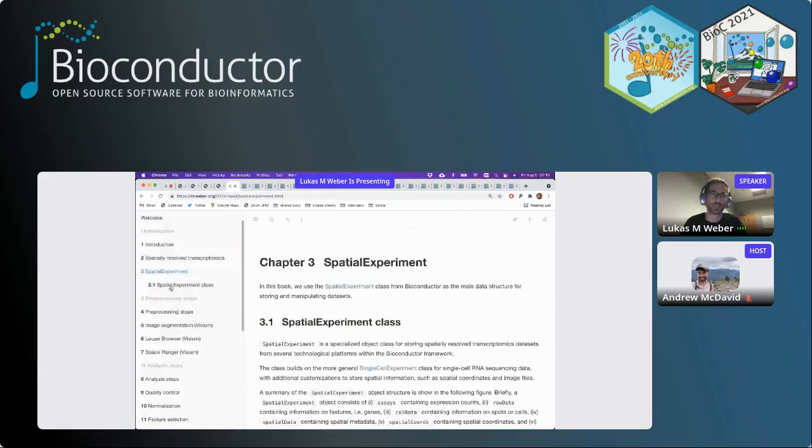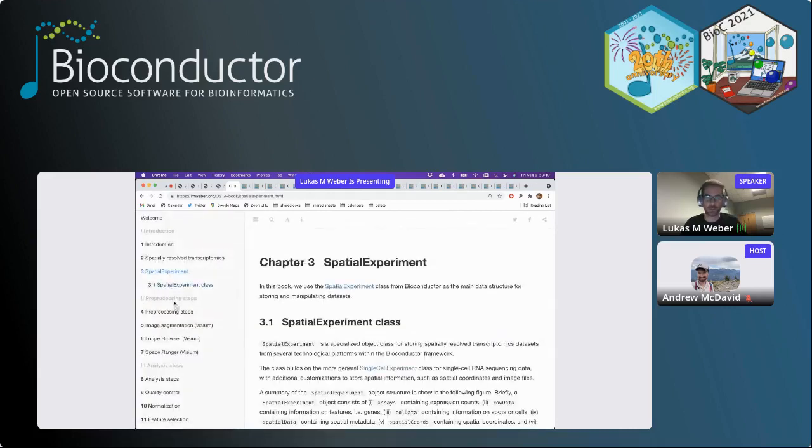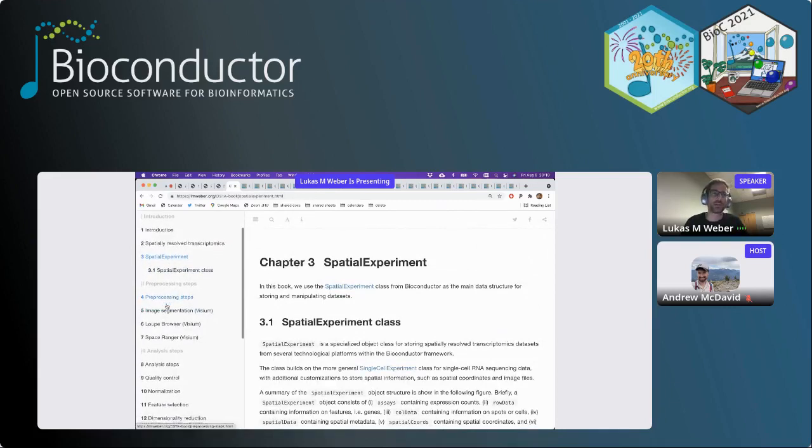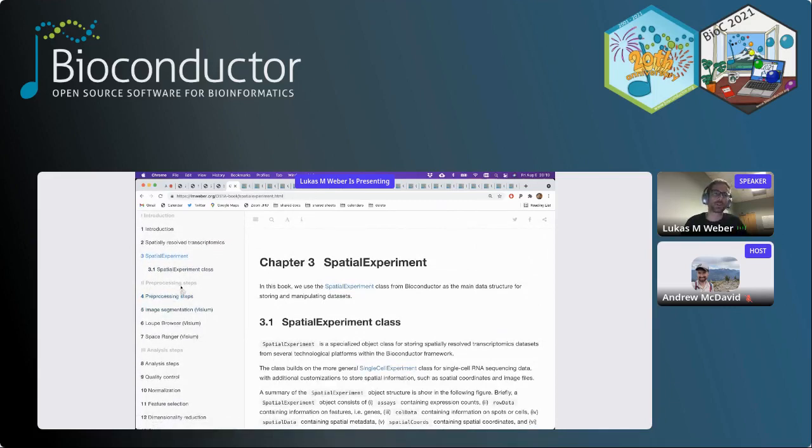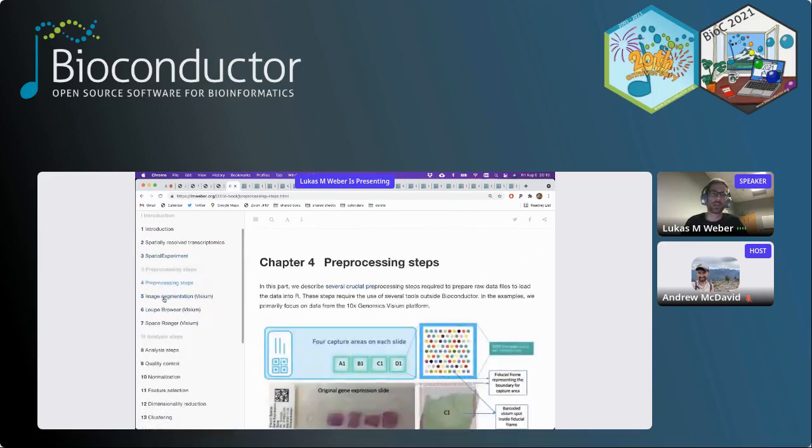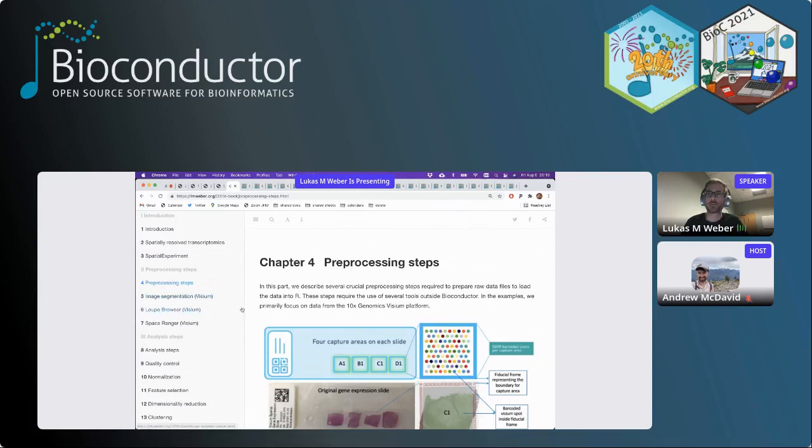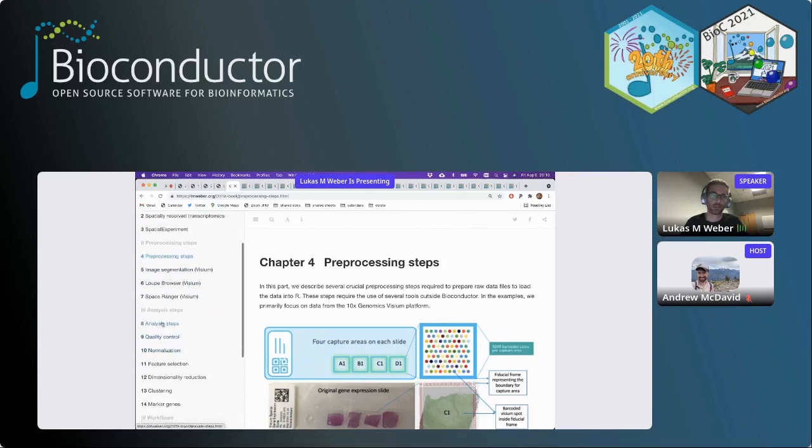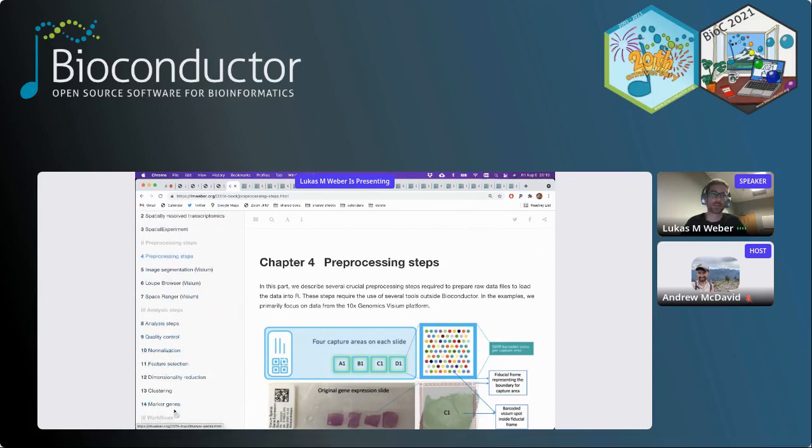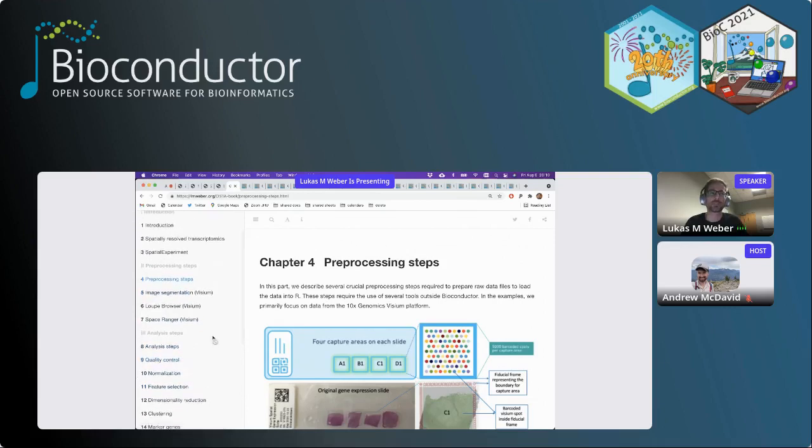In OSTER, this is the front page with the welcome and introductory material. There's information on spatially resolved transcriptomics and the spatial experiment structure. Then there's a section called preprocessing steps - these are the steps required to load the raw data from a Visium experiment into R for further downstream analysis. The later chapters are all the individual analysis steps.